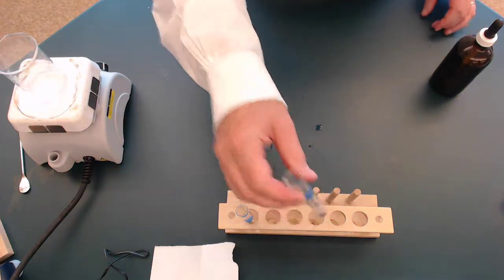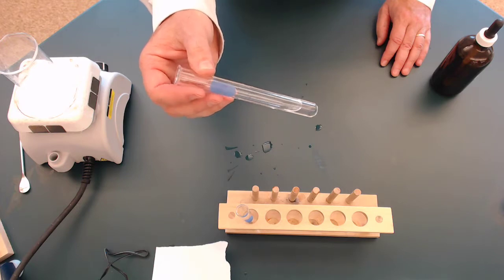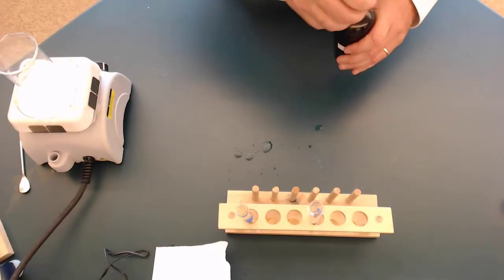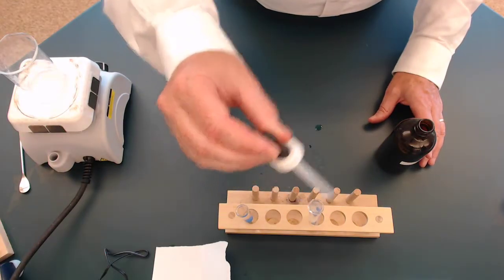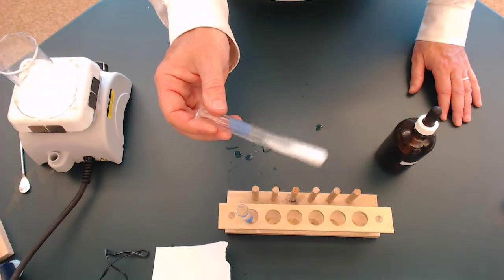In 1C, what we're going to do is take the second half of that salt water mixture that I have, and we're going to add something called AgNO3, which is silver nitrate, to it, and see what happens. Silver nitrate stains your fingers, so you don't want to get it on your fingers. When I add that in, look what happened.